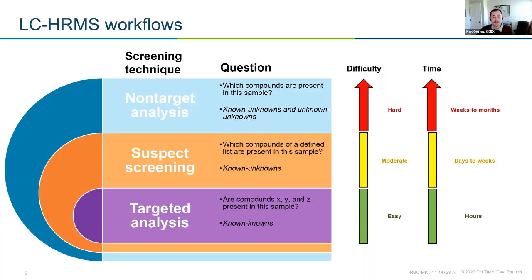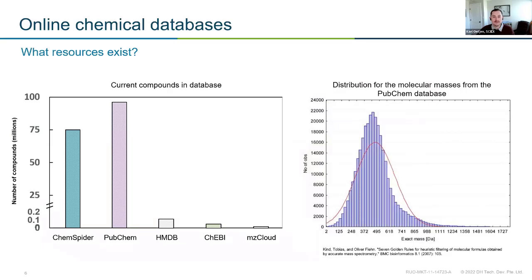So you may be asking about everything that's in my sample, or are you asking about just the fluorinated things in my sample? And the reason I distinguish that is because when we think about all the things that could potentially be in your sample, especially when we're talking about complex matrices, maybe serum or sludge, or maybe soils and foods, when we think about small molecules and the wide variety that can be present in our sample, we're talking about hundreds of millions of different compounds.